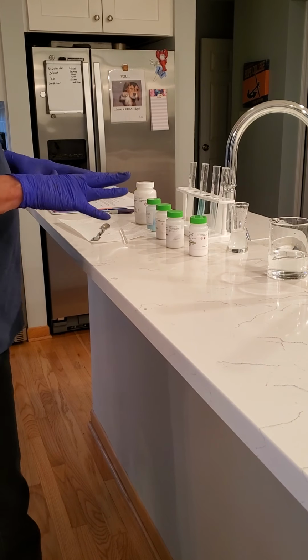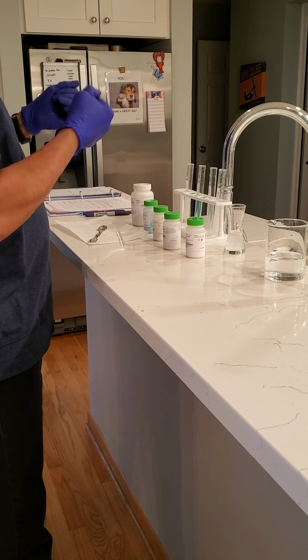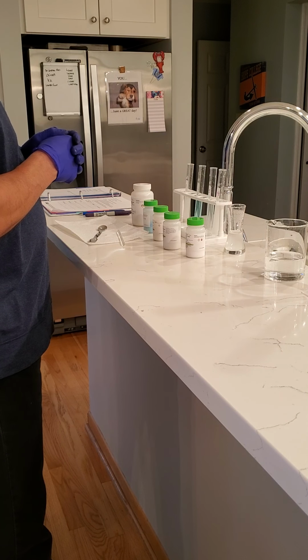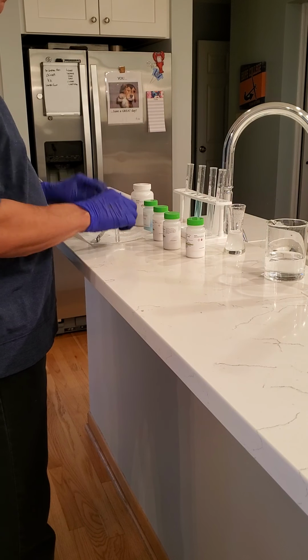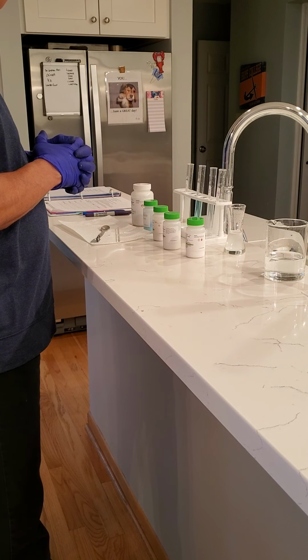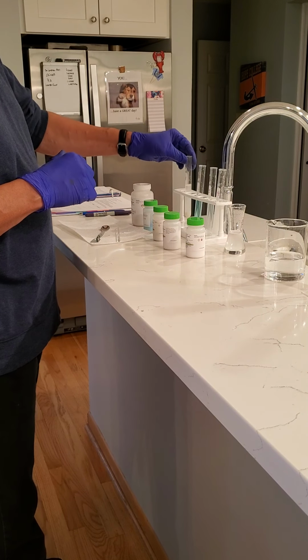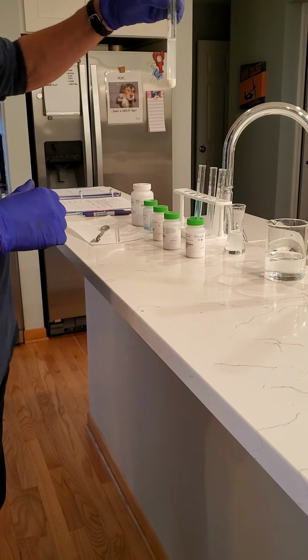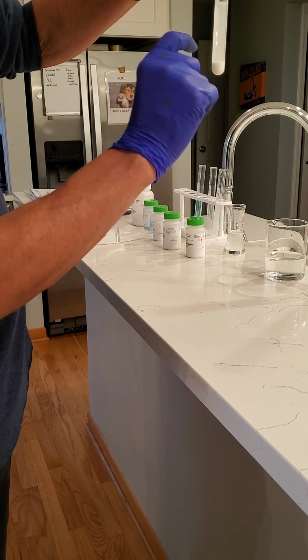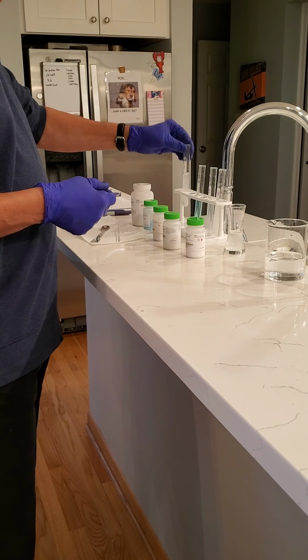Okay, class, so you have let the test tubes sit for 10 minutes, and you've shaken them periodically throughout that time, just to help with the solubility and the dissolving of the solids. And now you want to compare. You're going to rank these salts as either very soluble, slightly soluble, or insoluble. And I'm just going to show you what mine look like. So this is number 1. This is the calcium hydroxide, and note how the color is on the upper layer, and you still have solid on the bottom. So that probably is not very soluble.